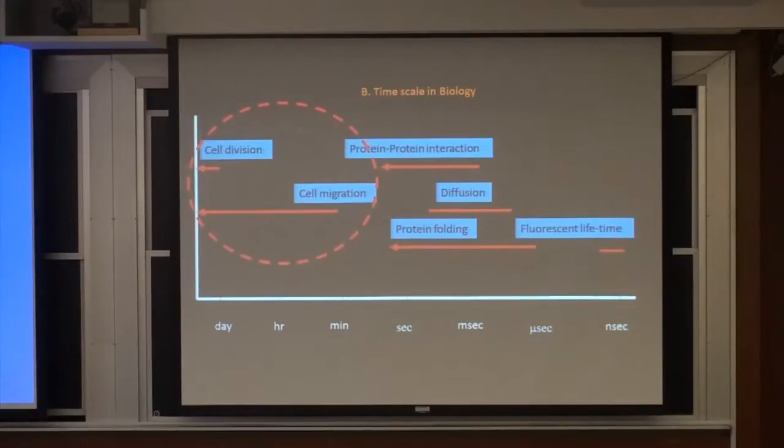This is very challenging with present-day techniques like confocal and spinning disk, because many of you are using these techniques, you know that if you take thousands of layers of images in one or two scans, you bleach out all the fluorescence. So you can't image continuously for such a long time.